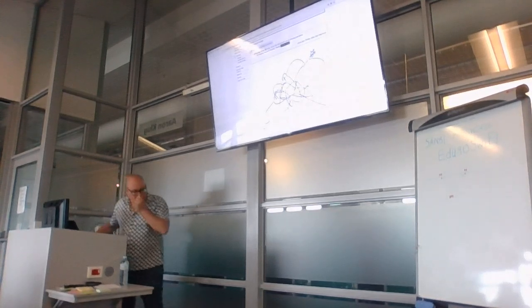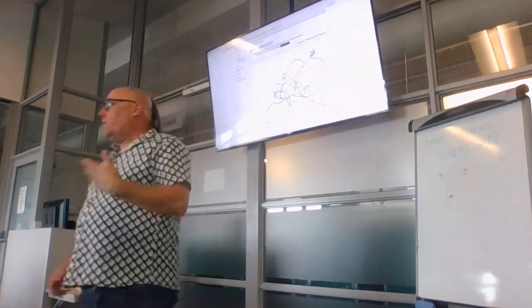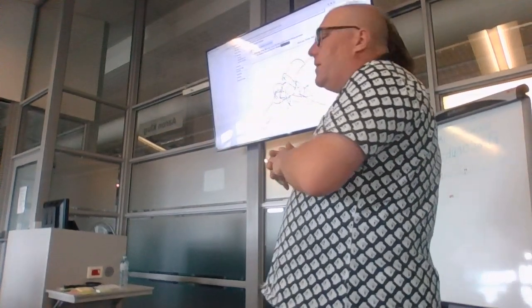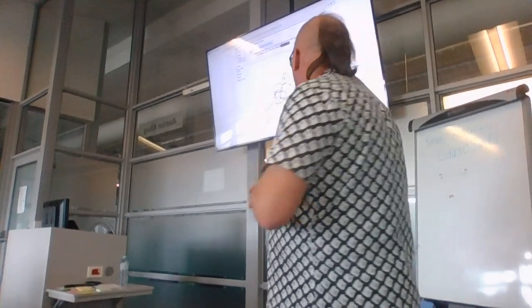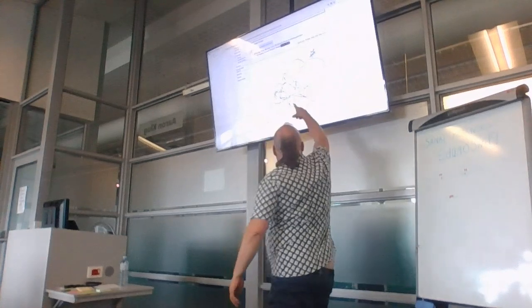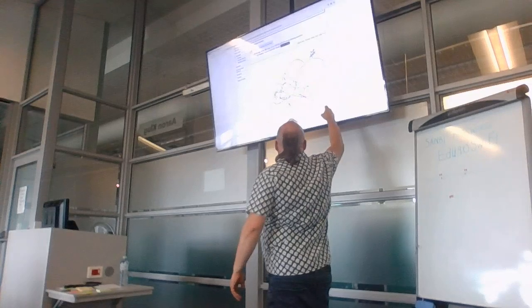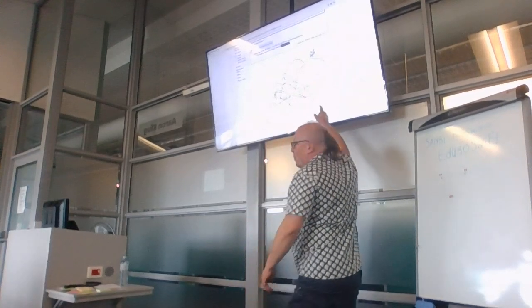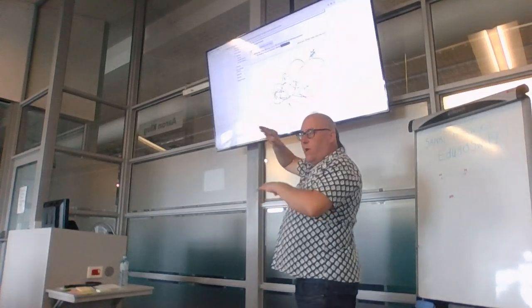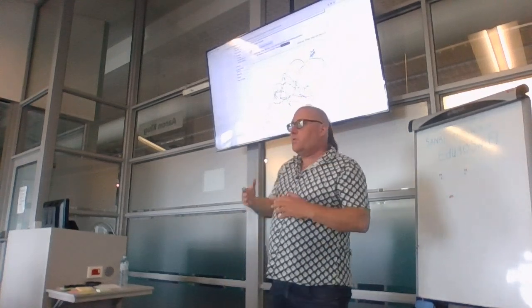This is an assembly graph of a Staphylococcus aureus genome done in Galaxy using only short reads. And what this assembly graph shows is that this is part of the genome, and then over here it can be either this piece or that piece, right? So when we've got a disagreement in the reads, then maybe it's this way, maybe it's that way, okay? But where these things touch, it's typically where there's repetitive DNA.